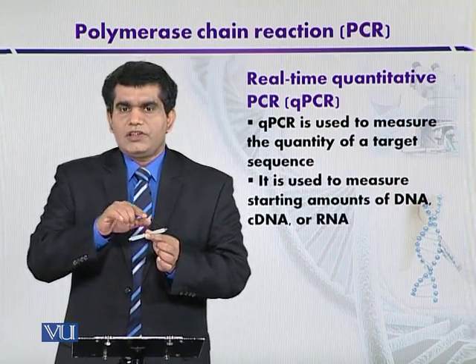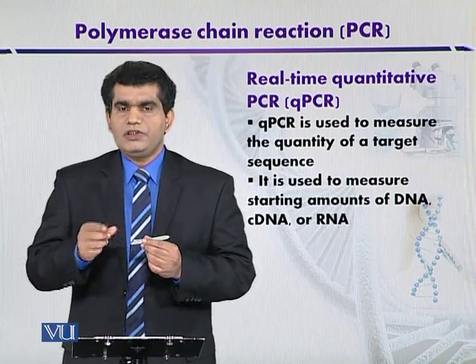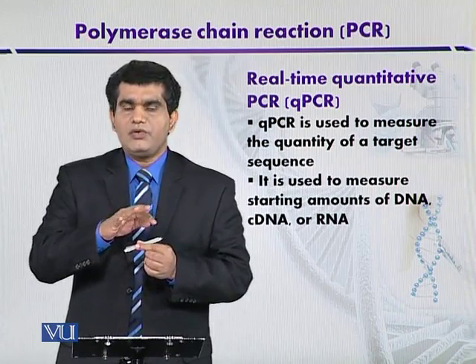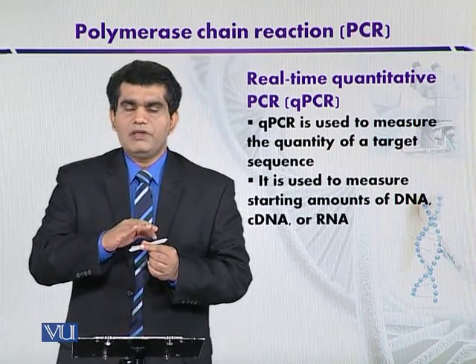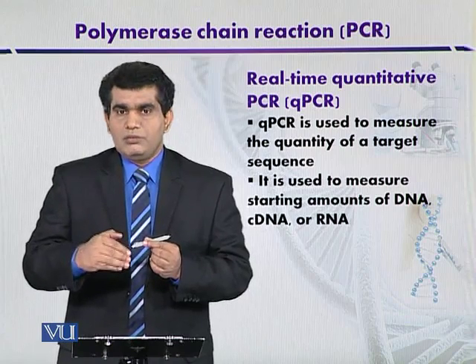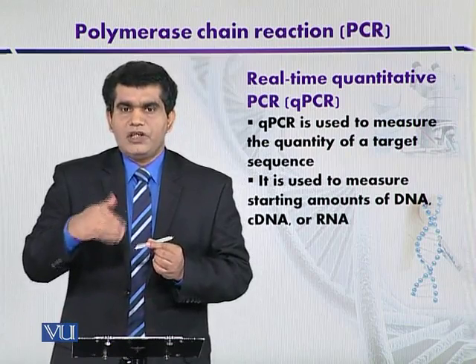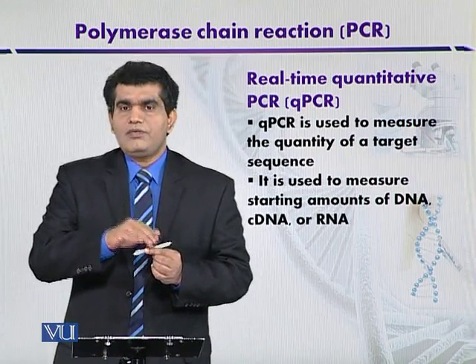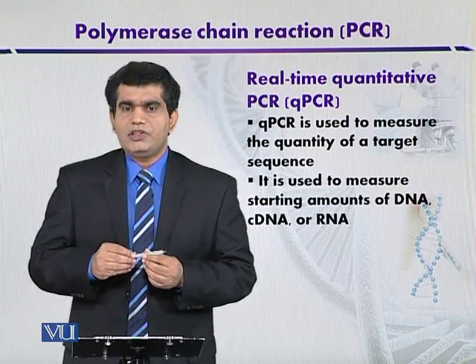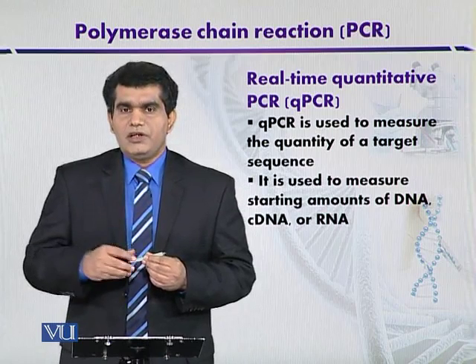And with the subsequent amplification, this probe is also removed. Now the quencher is not in the vicinity of the fluorescent dye. So the fluorescent dye, after cleaving because of the nuclease activity of the Taq DNA polymerase, is removed and it will record the amplification after each PCR cycle. So in this way, the more the fluorescence, the more the accumulated DNA concentration.